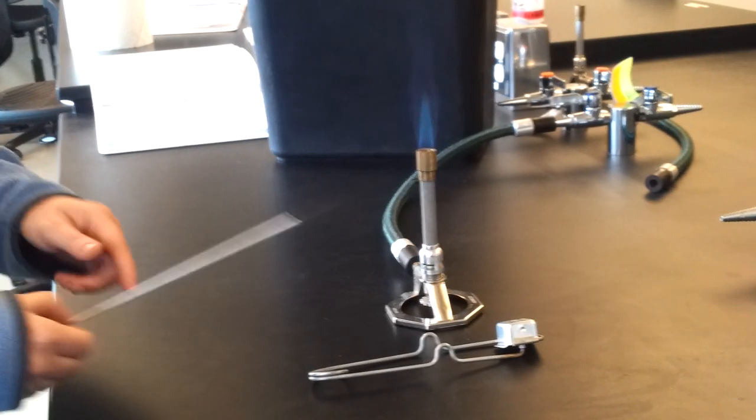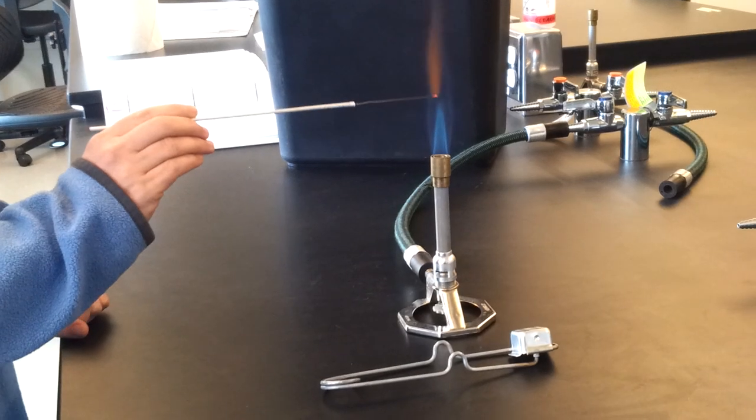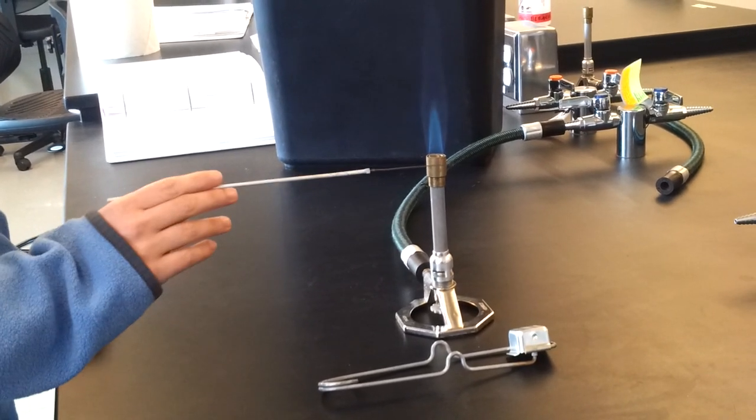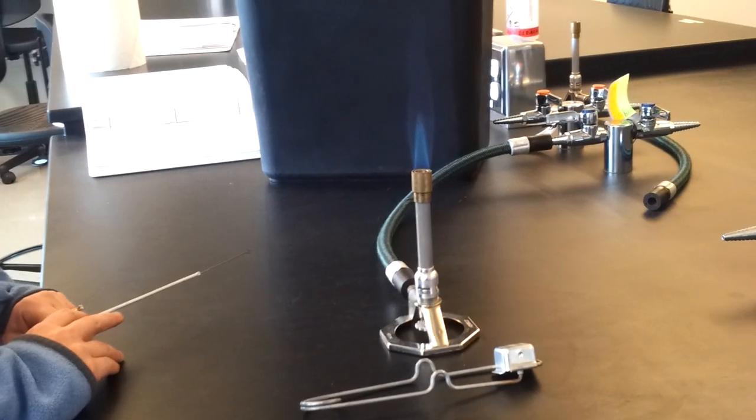You'll notice, I'll use the loop to show you, it has this inner blue cone, and that's what you want to see, and then there's an outer, lighter, or darker blue cone.